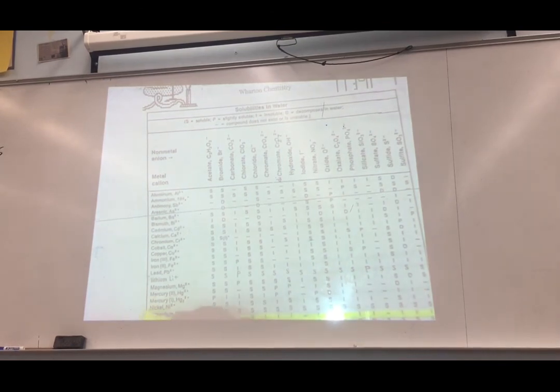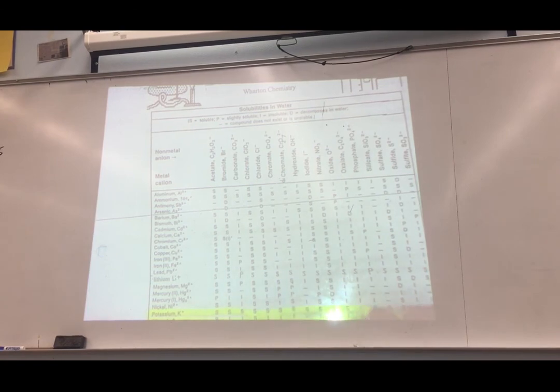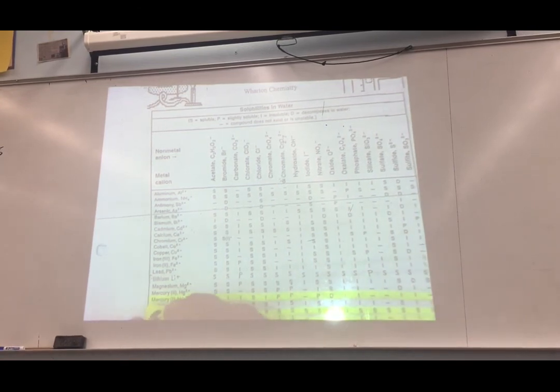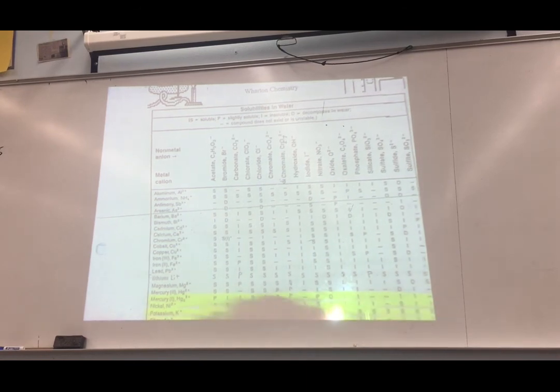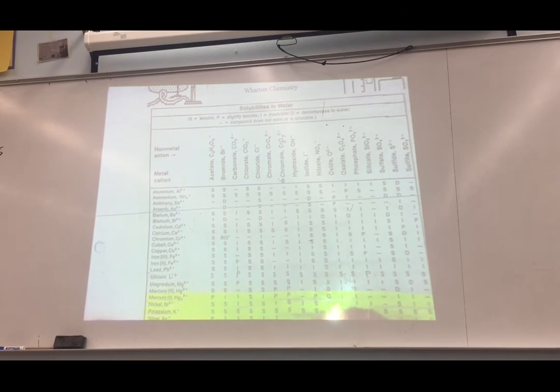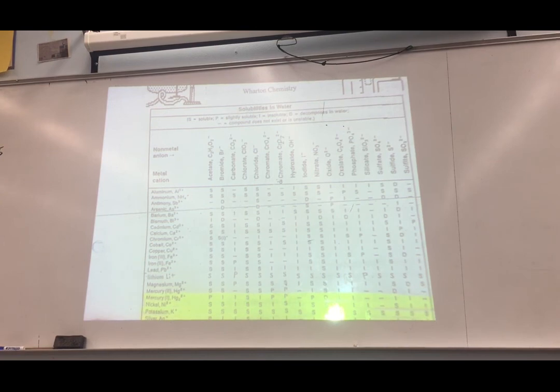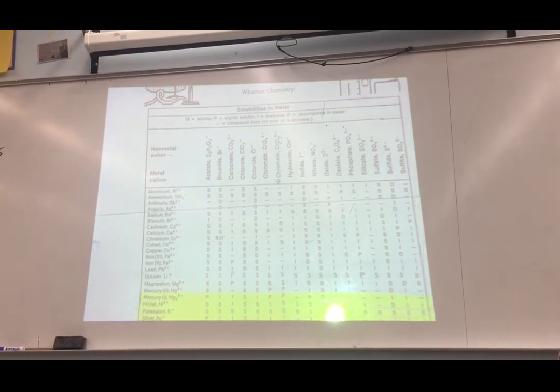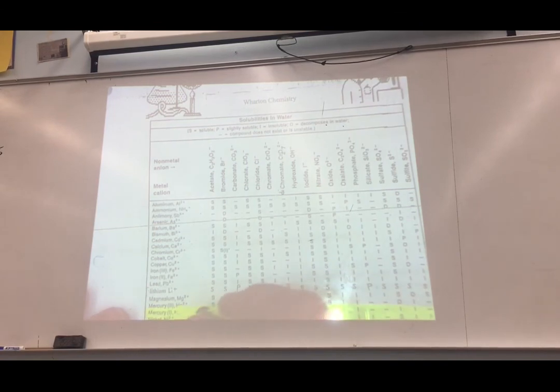Silver, potassium, mercury 1, nickel, sodium, strontium, do all of them. Let's see, mercury 2, no, lithium, yes.